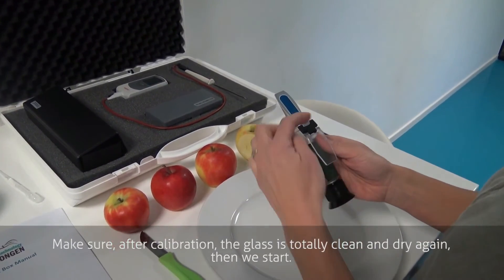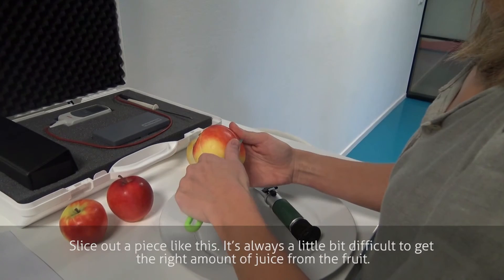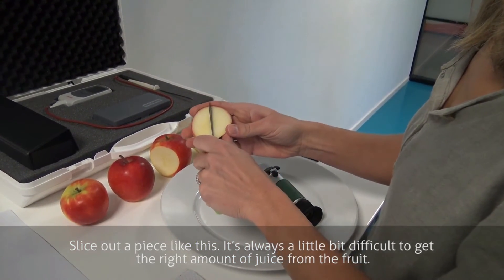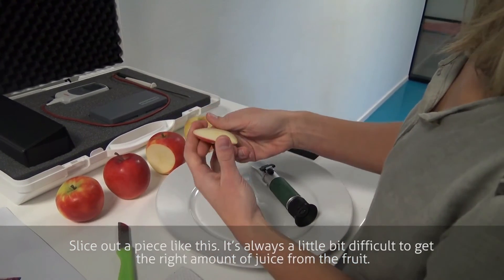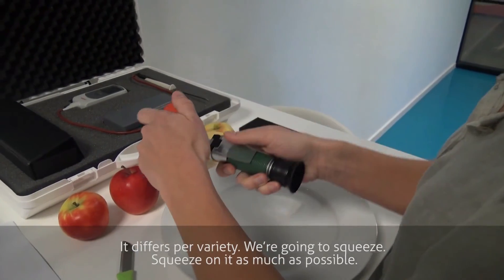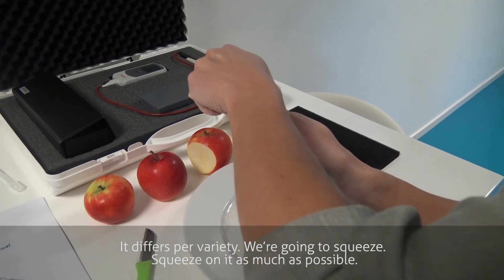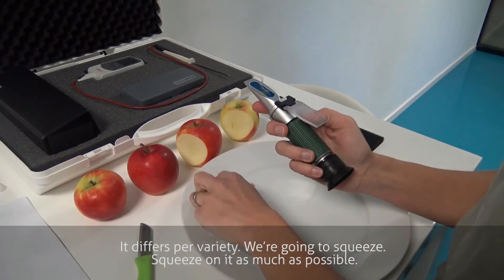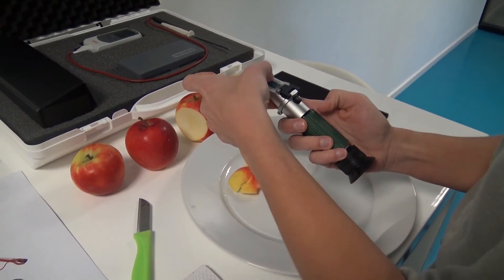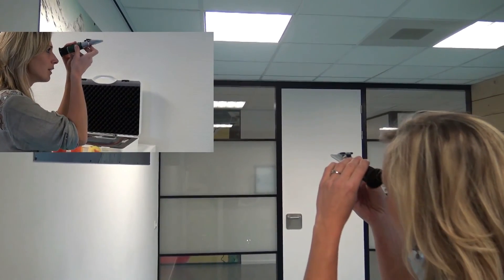Make sure after calibration the glass is totally clean and dry again. Then we start to slice out a piece like this. It's always a little bit difficult to get the right amount of juice from the fruit. The difference is by variety. Then we're going to squeeze on it as much as possible. And now we're going to look into the light again — and we see the sugar content is around 14.